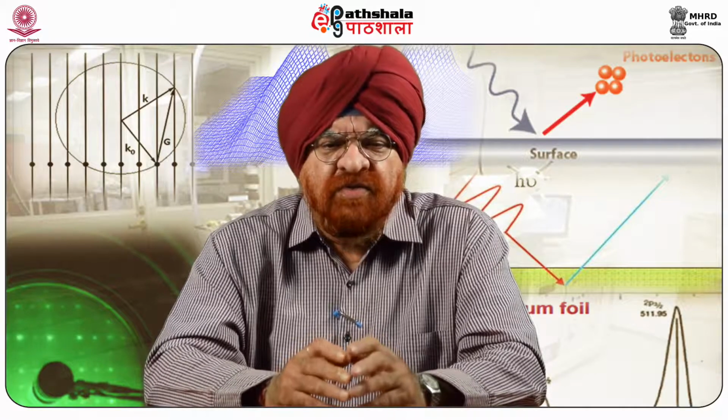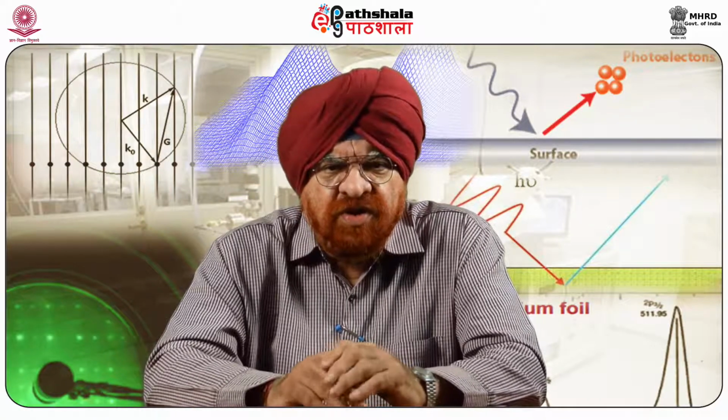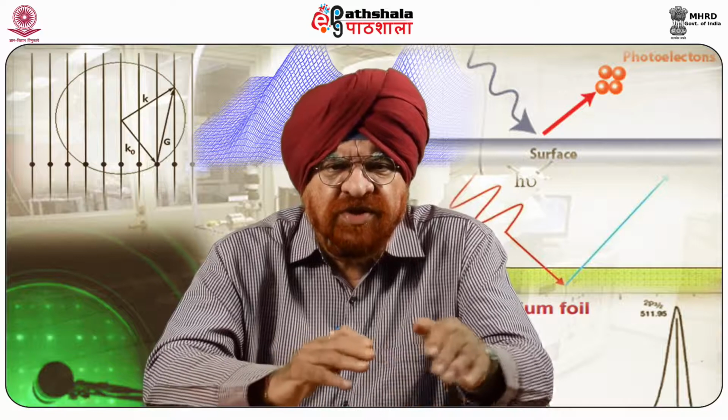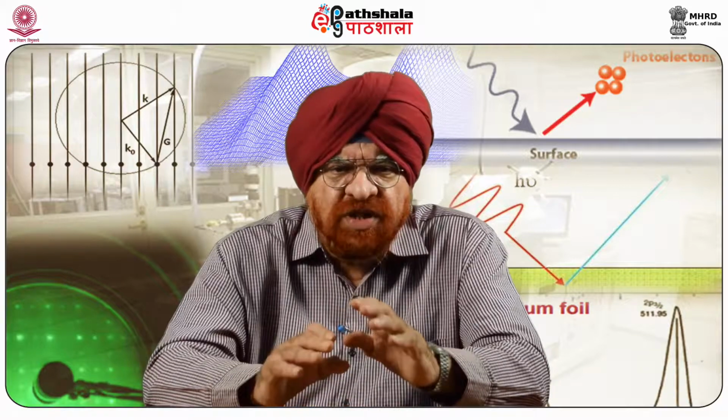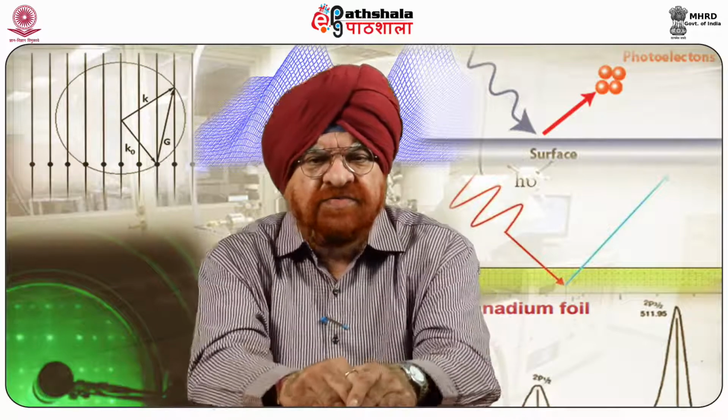Resolution in liquid and vacuum is increased because of the absence of strong capillary forces due to a thin liquid film on all samples in air. Unfortunately, biological samples can be challenging to study in contact mode because they are generally soft, weakly bound to the surface, and damaged easily. Efforts to image biological samples drove the development of non-contact mode in 1987.